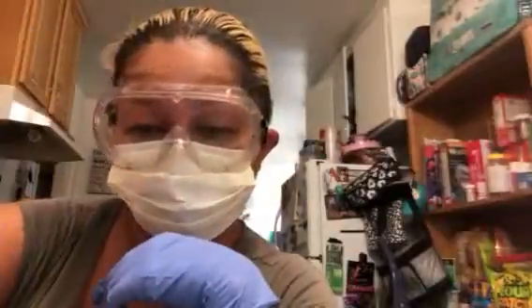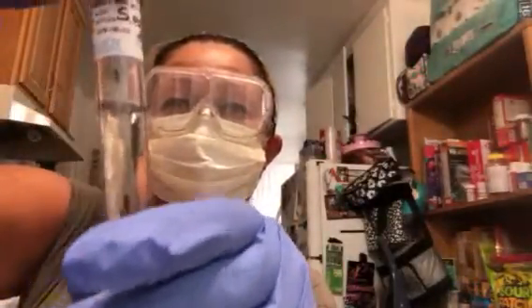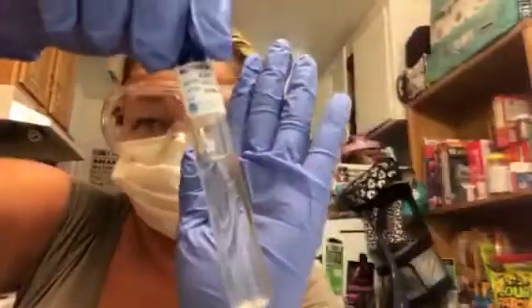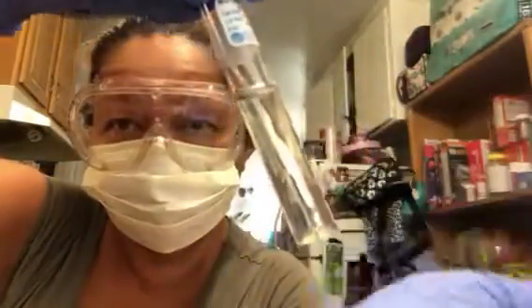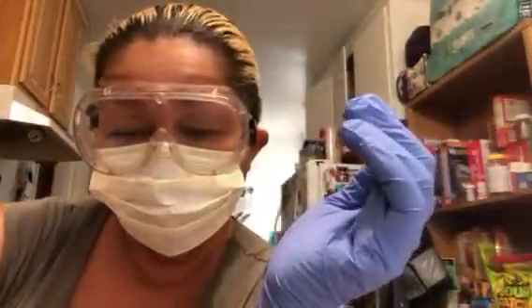At 7% NaCl, and then this is the nutrient broth with 15% NaCl. S. epidermidis, basically clear. Pretty clear. Clear, the most clear out of those. Okay. So that is the result of exercise 1, the salt tolerance testing.